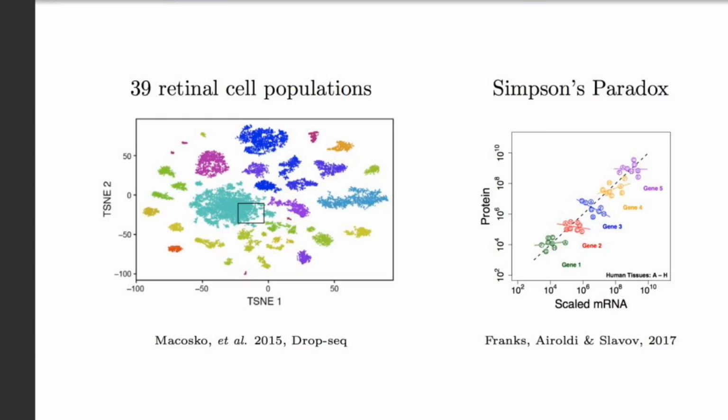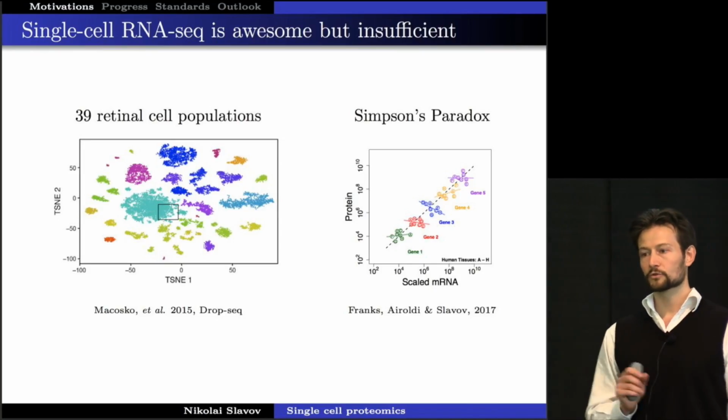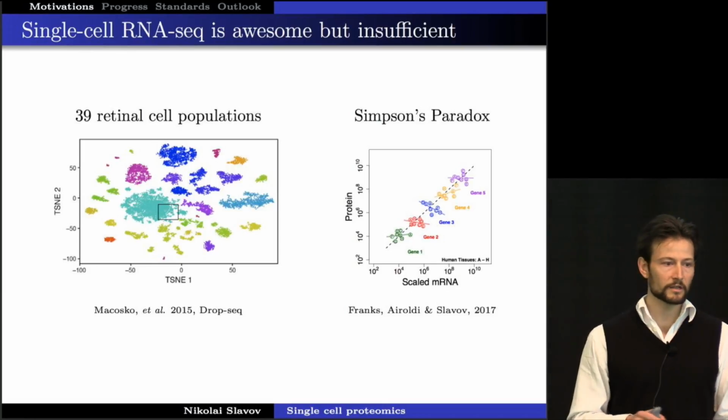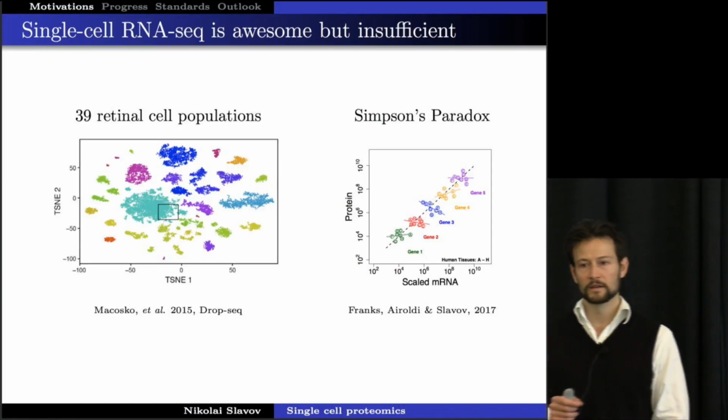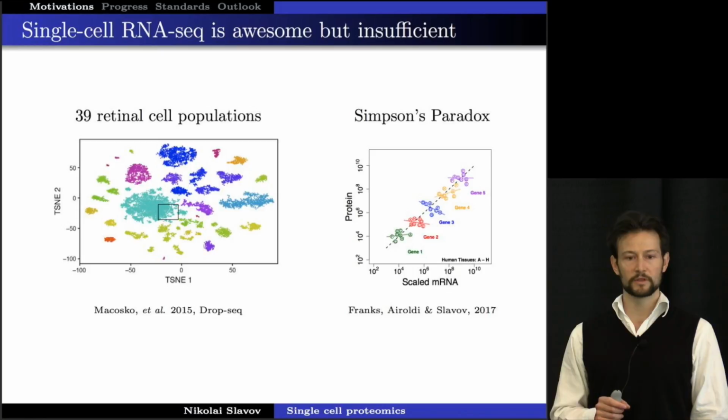Well, the transcriptome is very useful, obviously, to classify all of these cells, but it gives an incomplete description. Just to give a couple of anecdotal examples, there can be important membrane ion channels that are present at the protein level, but they're long-lived. They were synthesized a while ago, and they're not present at the mRNA level. On the other end of the spectrum, there could be messenger RNAs that are simply not translated, or proteins that are being translated but very quickly degraded. That is the primary mode of regulation. And in fact, we have evidence that a lot of that is happening.